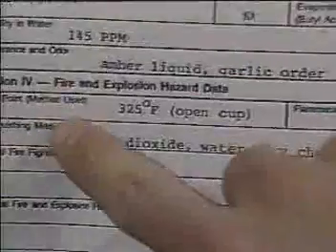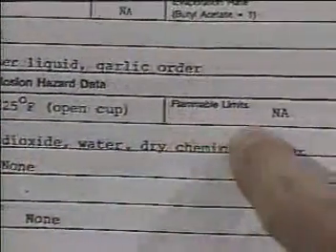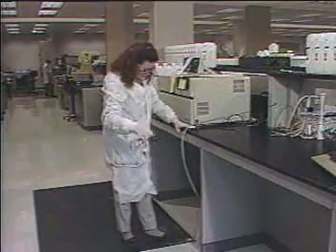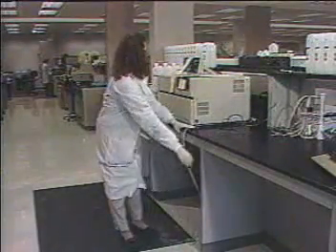Consult your material safety data sheets for information on flash points, ignition temperatures, and flammability limits. Beware of static electricity. Make use of all static guard devices provided for you.